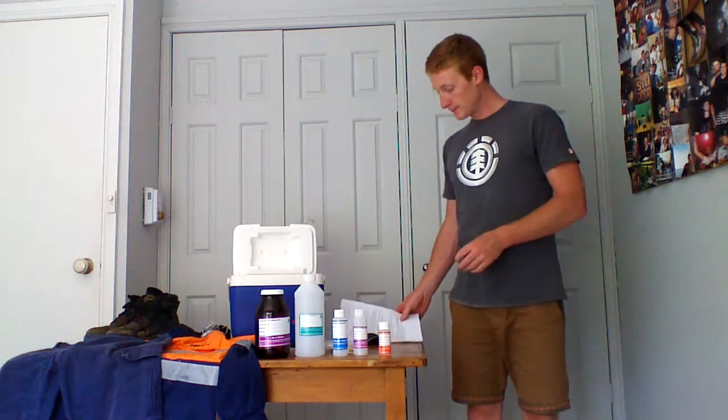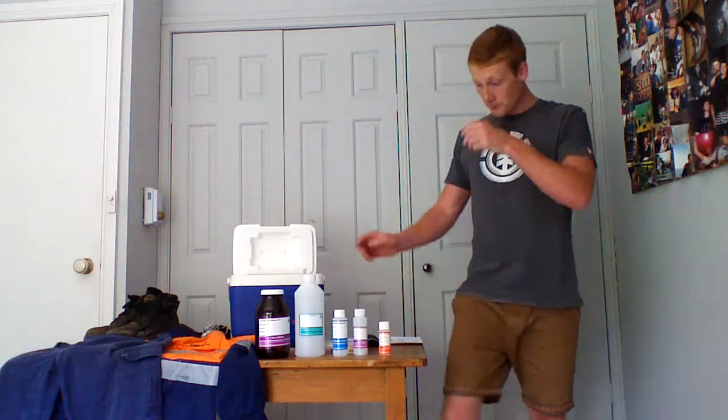Okay, so now I'll demonstrate the correct method. For an example, say SCIT2100 requests a sample at the university for temperature, dissolved oxygen and pH.